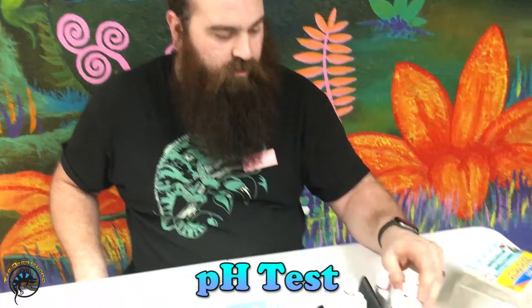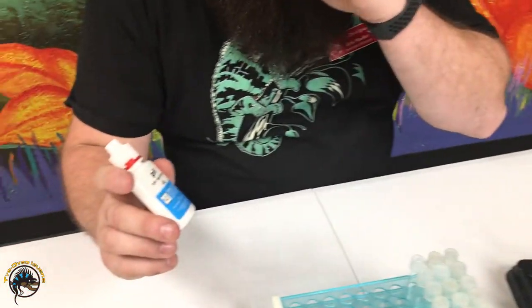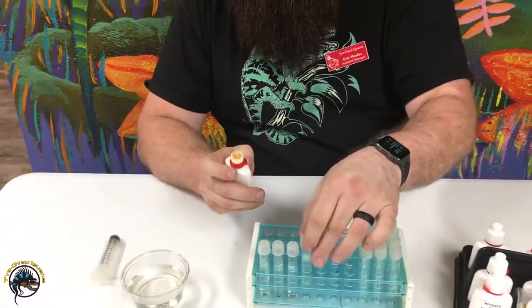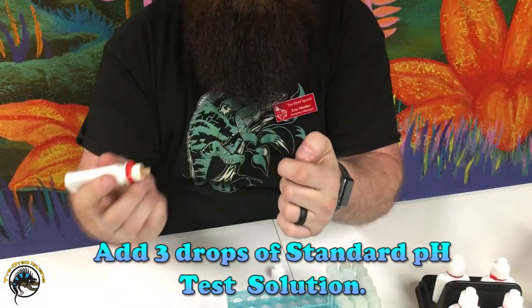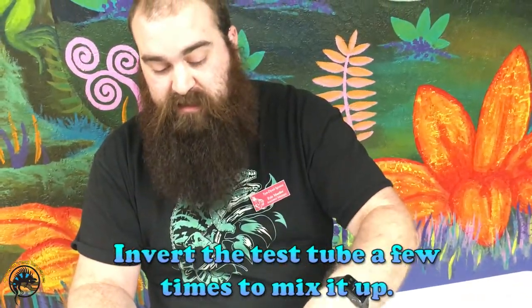First one, we're going to use the standard pH test kit. It tells you exactly how many drops to use — this one we use three drops. Then just invert it a couple times to get it to mix up in solution.